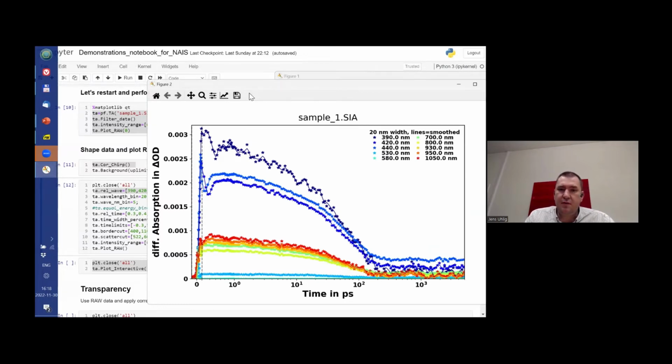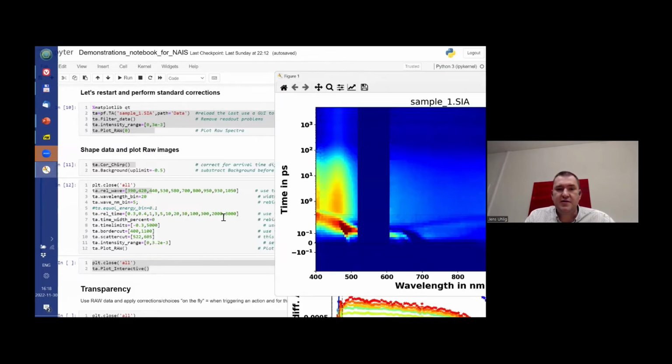So I look in my 2D plot, I select the wavelengths, I type them in here. And yes, this is typing by hand, but this is just typing a few numbers, which I read from my plot. I change the times I think are interesting to look at, and I can work myself stepwise until I have a plot I like to use.